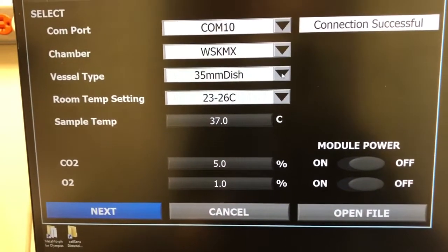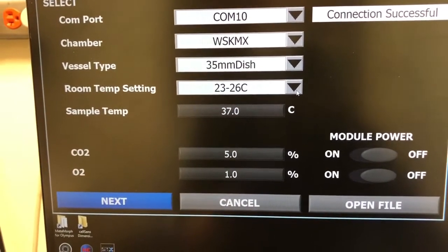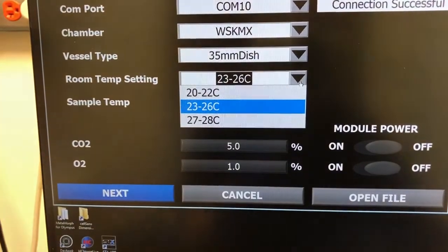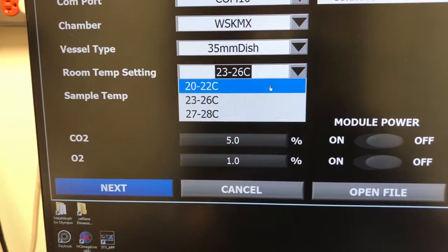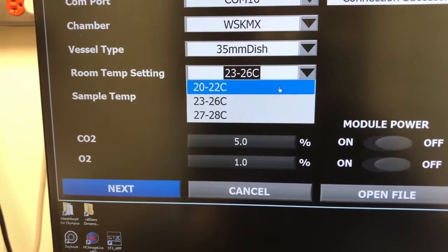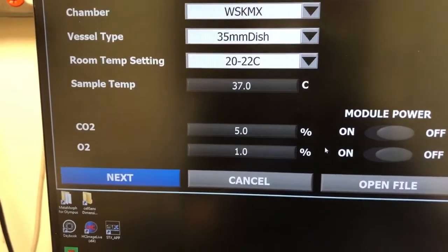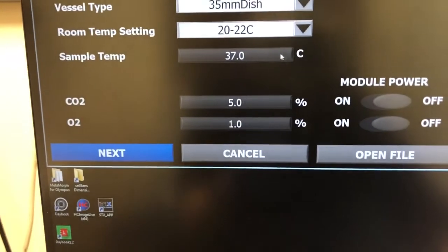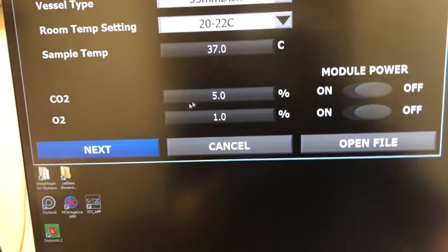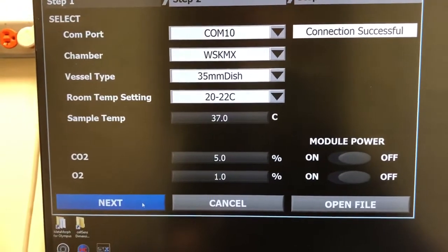You need to tell it what vessel you have. You need to tell it what the room temperature setting is, which in this case is usually 20 to 22 degrees Celsius. And then you click on Next.